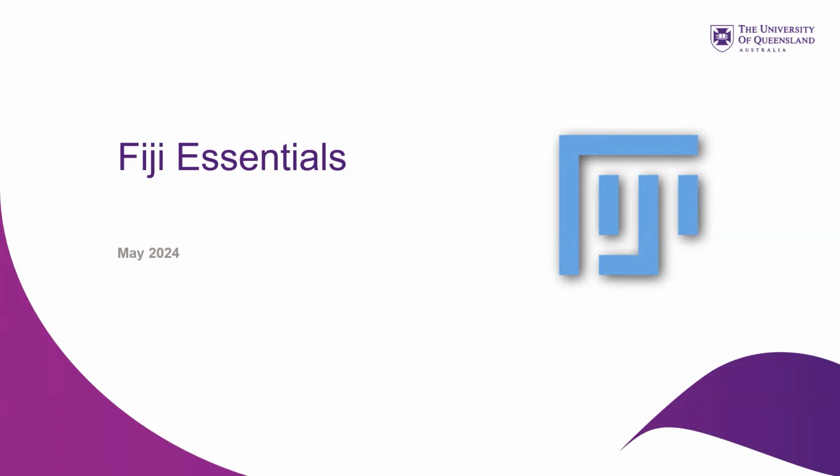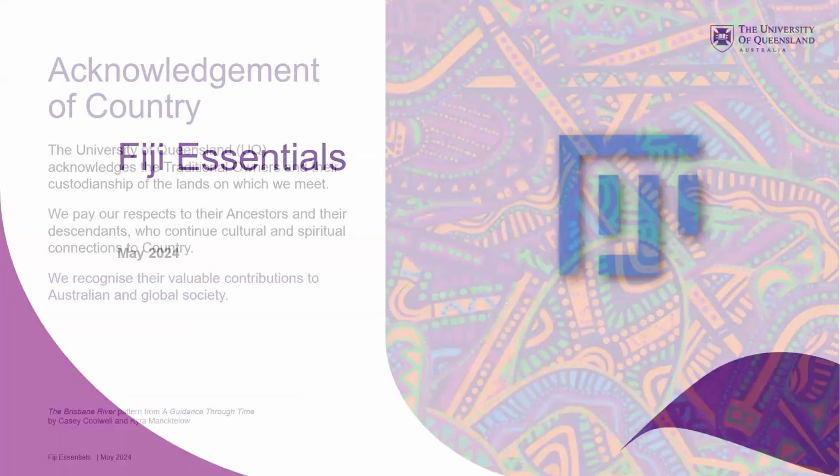So thank you for coming along. Hopefully you'll get something out of today's workshop and not be afraid of Fiji. I will say that I'm going to say Fiji and ImageJ interchangeably. They're more or less the same thing. Fiji just has extra stuff added to it, but it uses the ImageJ engine underneath.